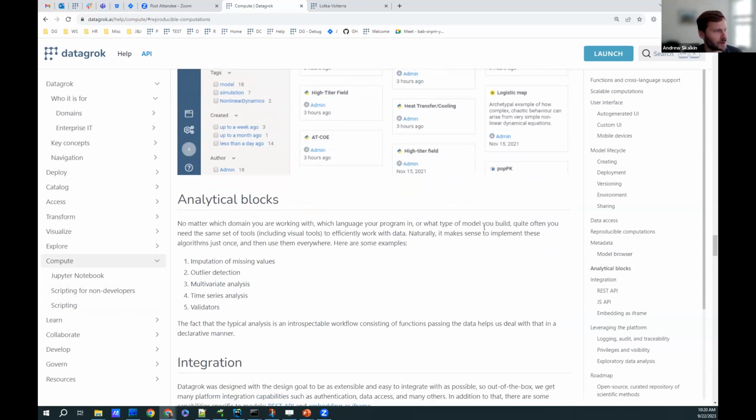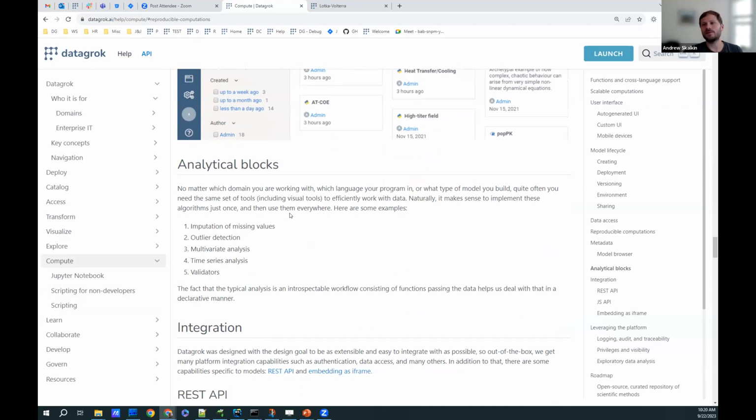In addition to all of that, we can also introduce universal analytical blocks that would work with different functions. So things like detection of outliers or sensitivity analysis or exploration of different parameter spaces. These concepts and these approaches are universal. They are applicable to every function. And this is exactly what we are doing. In the next presentation, Victor will show some of the capabilities that this feature unlocks, where you start with a function and then you start exploring it in different ways.